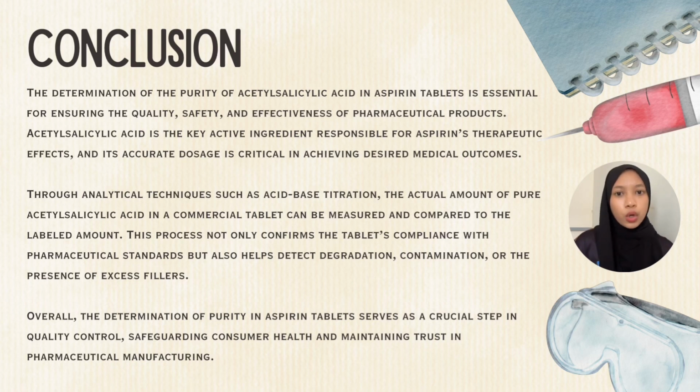This process not only confirms the tablet's compliance with pharmaceutical standards, but also helps detect degradation, contamination, or the presence of excess fillers. Overall, the determination of purity in aspirin tablets serves as a crucial step in quality control, safeguarding consumer health and maintaining trust in pharmaceutical manufacturing.